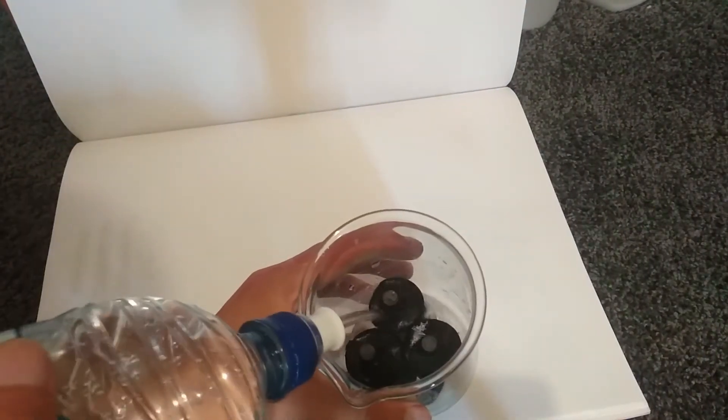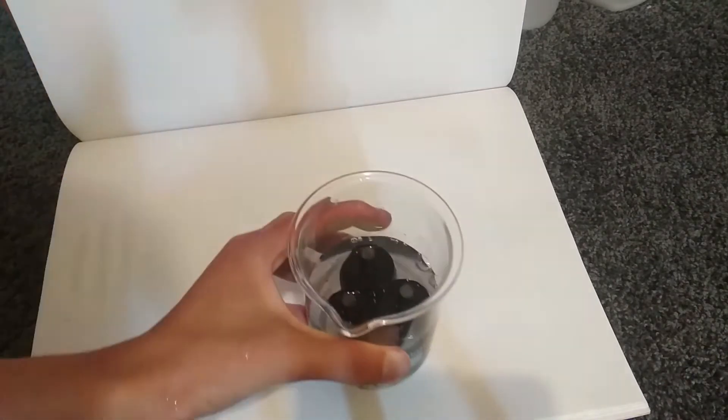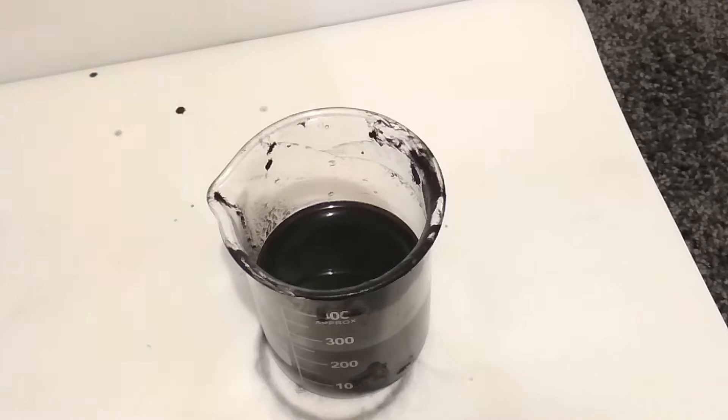Now we just wash it out with water to get out the electrolytes and other water-soluble junk, and filter it out.